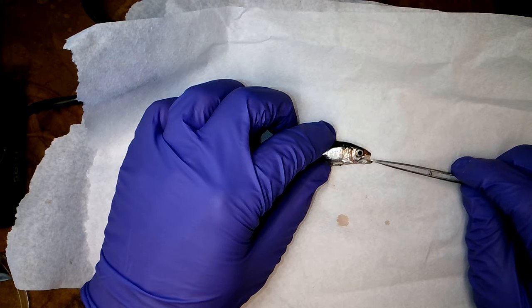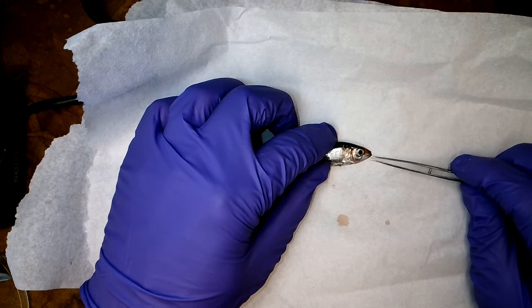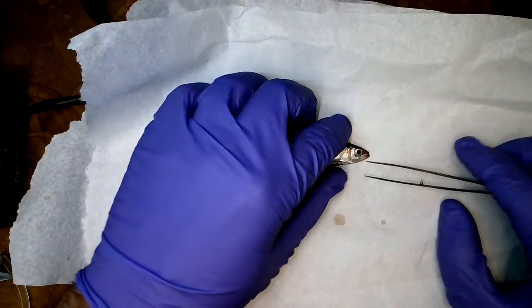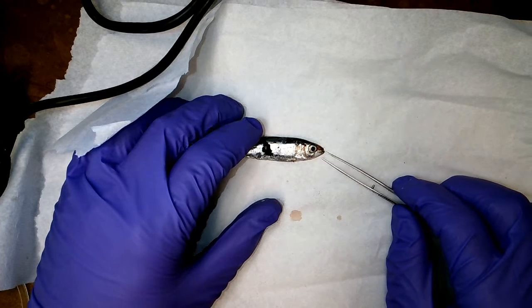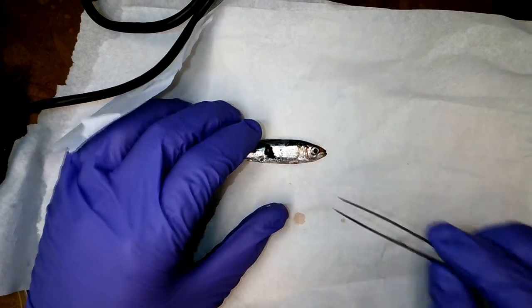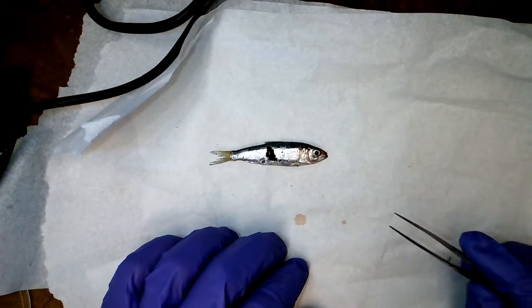Okay, when its mouth is open, generally it's projecting forward. If you close it, you get a good look at that. Let me zoom in for you. Right, so hopefully everyone can see that where the jaws and lips are here, this mouth is projecting forward. So that would be the first giveaway. You can look at the last dorsal ray as well.